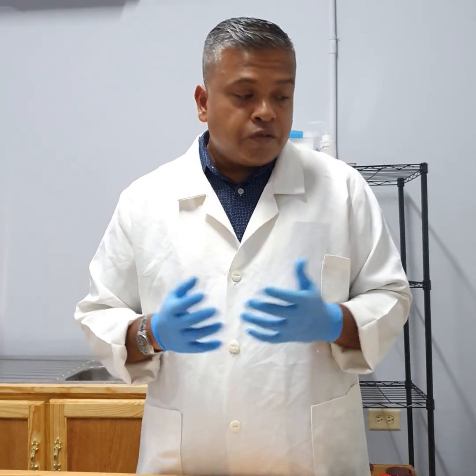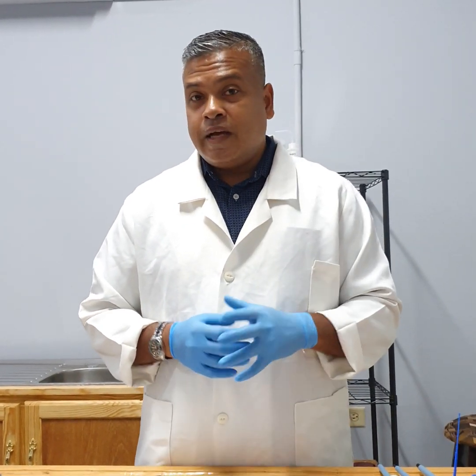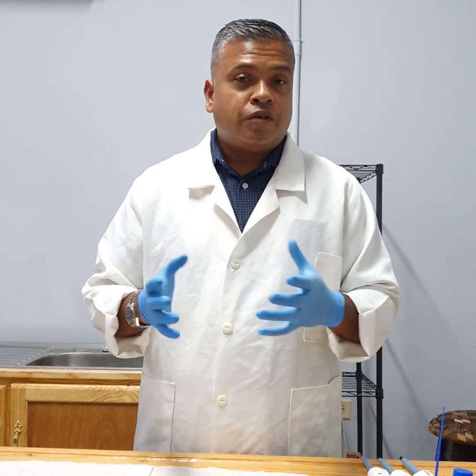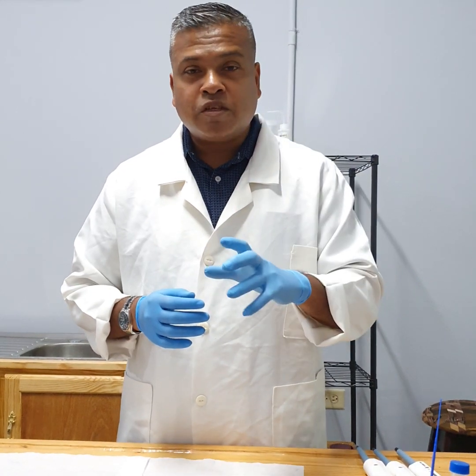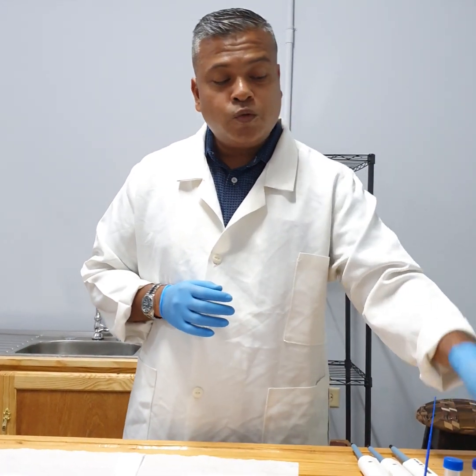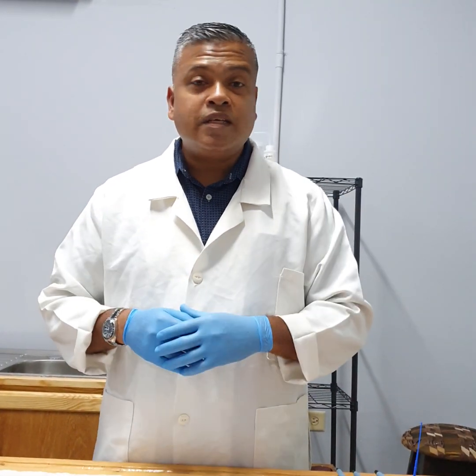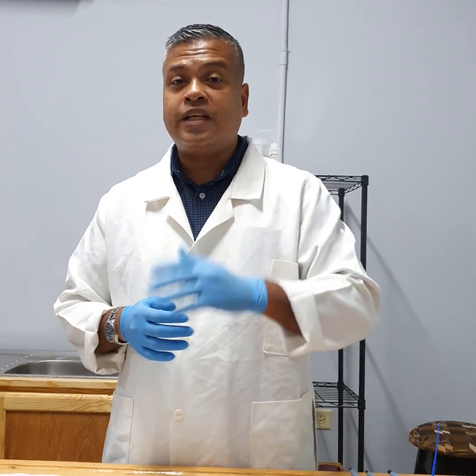These pipettes are very, very useful tools, and today was a little introduction, a little overview for you as the public to be aware of what your tests involve and how important the laboratory industry is. And when your doctor asks for particular tests, many times it comes down to precise measurements, because remember I told you that blood is a transport mechanism. You've got all of these things, hormones, electrolytes, salts, wastes, nutrients being transported at any given time.